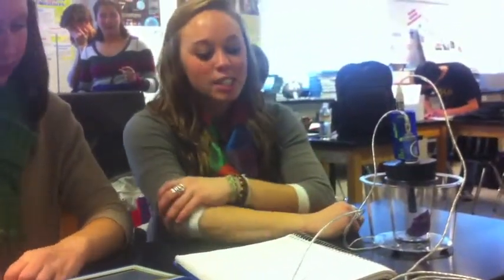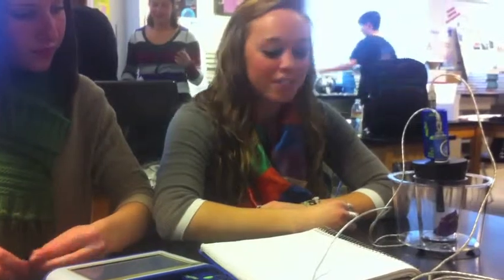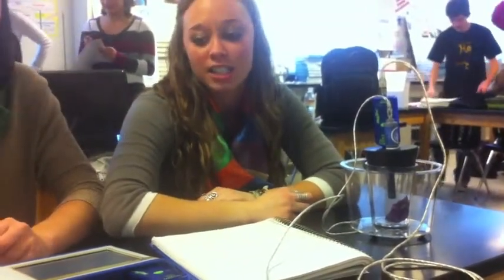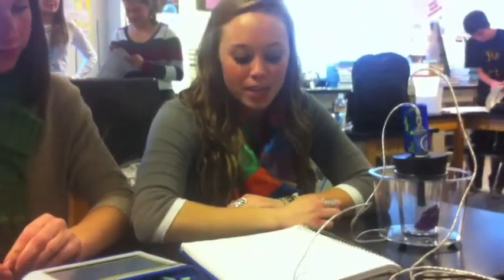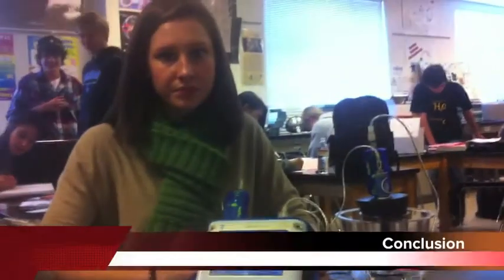So the procedure for this experiment is that we would take 3 grams of both the spinach and the cabbage, and we would have the oxygen probe and CO2 probe both within the same container, and we would just record and observe how the oxygen and CO2 changed between the spinach and the cabbage. And we would do that for both cabbage and spinach.